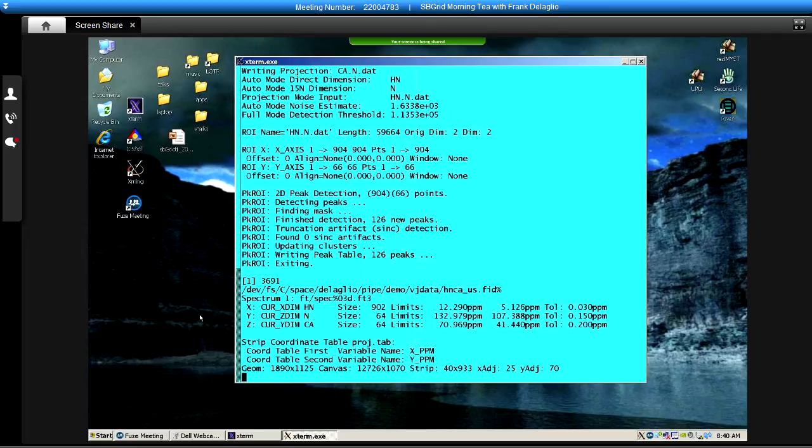And in particular, for people who use Agilent and Varian spectrometers, we also have the SpinSights forum, which has additional materials that are specific to data from Agilent and Varian spectrometers. So if you're not a participant in that SpinSights forum, it's a nice place to join to find information and examples like that. And can you process data that is non-uniformly sampled in NMRPipe?